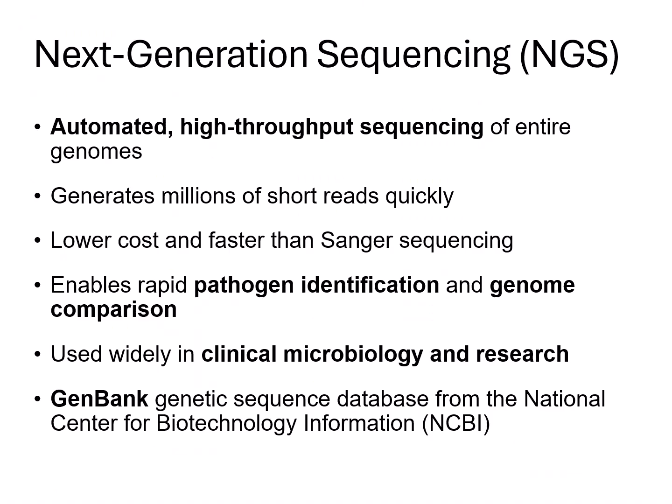So those sequencing methods are good for low volume or small volume cases, if you're just starting to sequence maybe a plasmid. But if you need to handle a large volume of information in a short period of time, we're going to require something that's more high throughput and automated. So that takes us to next generation sequencing. In next generation sequencing, or NGS, this is a really powerful version that can read entire genomes, like the human genome, in a single run.